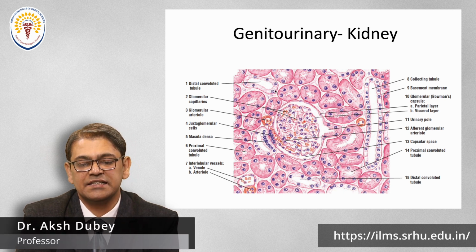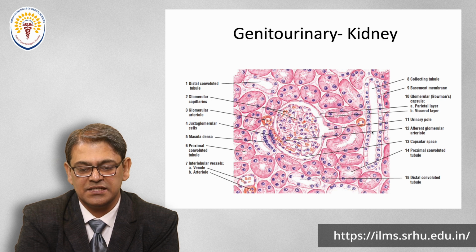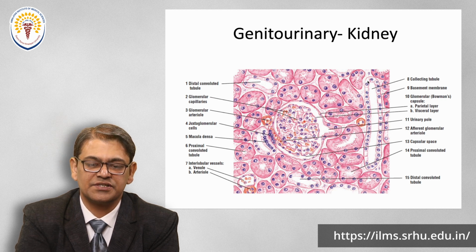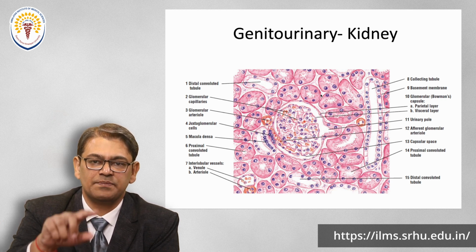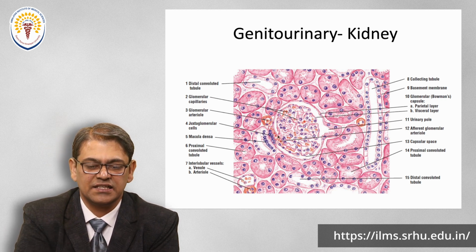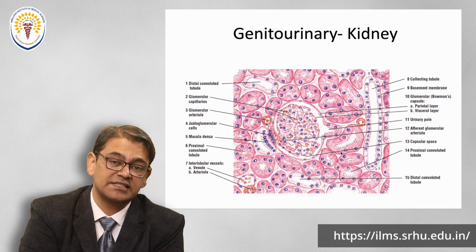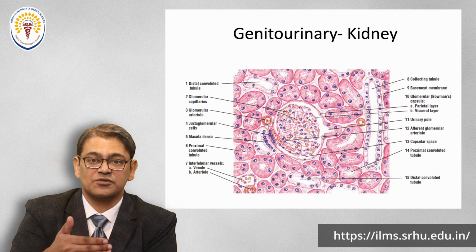So we can clearly see this is one layer of the tubes. There is another area of the tube, and there is a third tubule here. It is a longitudinal structure with cuboidal shaped cells in its wall. What does it mean? That means we have three areas of the tubes, and these areas are actually repetitions of an overly coiled tube, and in the section we see this one. These tubes may be related to this nephron or maybe to another nephron which is situated either deeper to that or superficial to that.